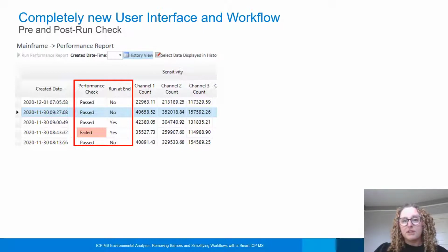The performance criteria checking during startup, and now at the very end of the day, means that you know the instrument state at any one time. Knowing the instrument status after the whole batch finishes allows you to know the performance and verify the instrument condition before turning the plasma on the next day.